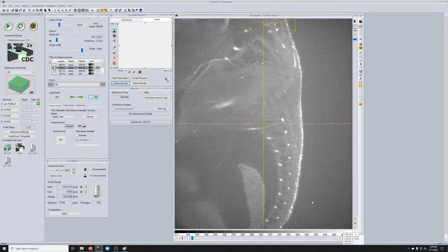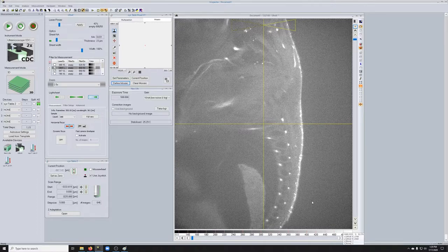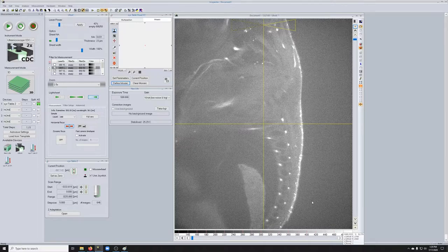As a result, on this system, it's a good idea to do tiling with cropping. So not by itself with the full size of the image, but rather with a smaller region. Now how to set how small a region you need, that's a matter that requires some experimentation. So you can ask us for advice.